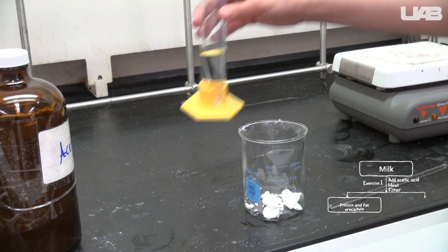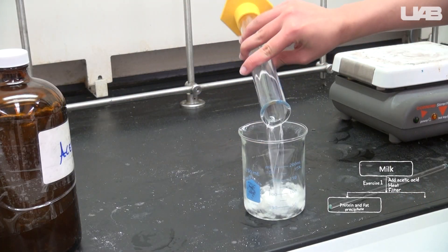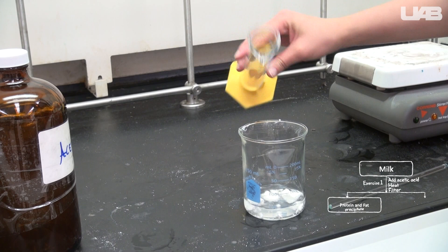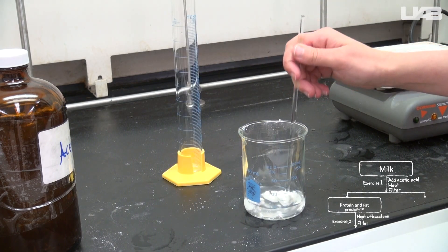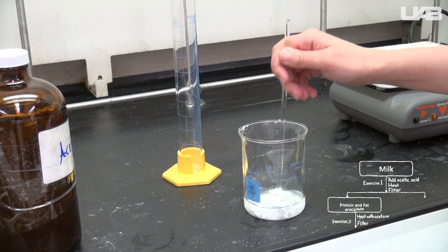The exercise two group should head to the hood and add about 35 milliliters of acetone. Break up the chunks as much as possible to expose more surface area to the solvent.